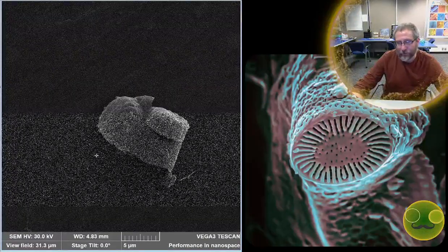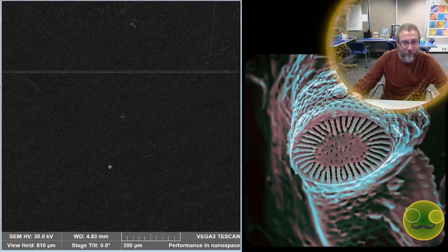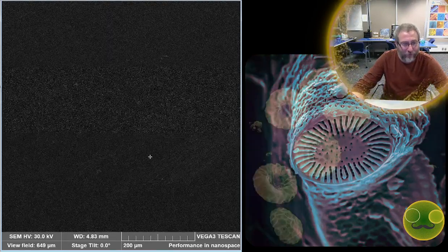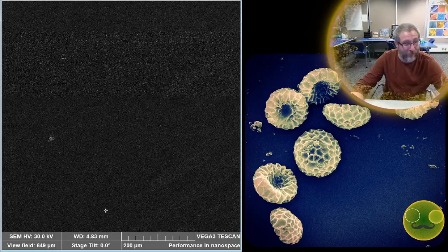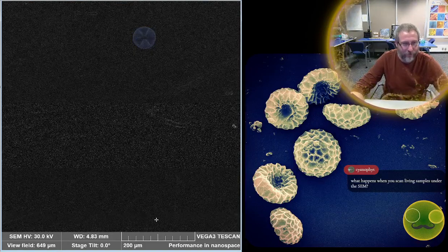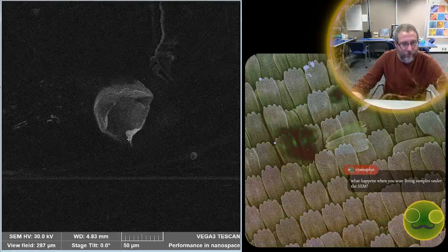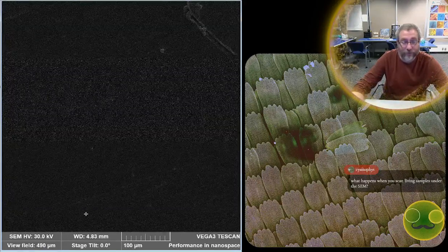Of course, it's meaningless for us because we're looking at stuff that's silicon dioxide, all of it. So it's going to tell us that our samples have silica, oxygen, gold, which I covered the samples in to make them conductive, and aluminum, which is basically what the stub is made of. The elemental composition would not be very interesting for these samples, or any samples I usually look at for my research. So I hardly ever use the elemental analyzer, but there are geologists here who might look at minerals, trying to figure out the elemental composition of something, and this instrument can do that.